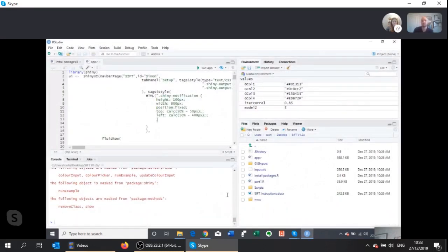Send it away. That's fine. So if, for example, we had a package that wasn't installed properly, where the red text is in that bottom window there, it would come up with an error message. So if that happens and you struggle, just email me and I'll give you some instructions to fix that one.